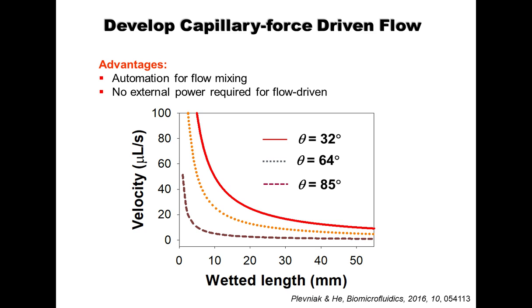Capillary-force driving is very important in this development because we want to reduce the power usage. If we can treat the surface of this 3D-printed microfluidic mixer to be very hydrophilic, this can introduce the flow into the microfluidic channel automatically through capillary-force driving. That means we don't need any power supply to drive the flow.